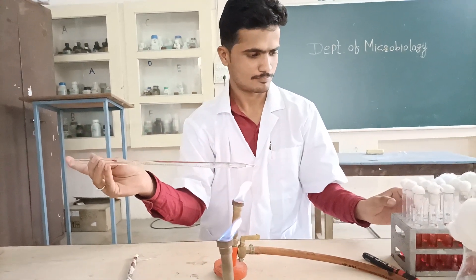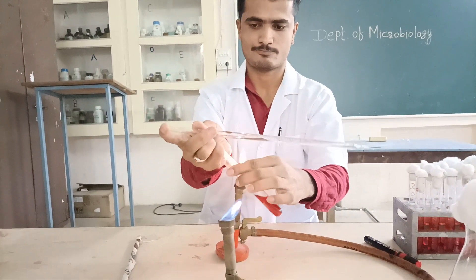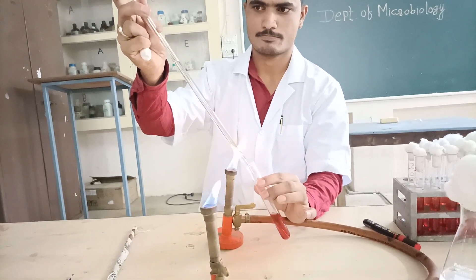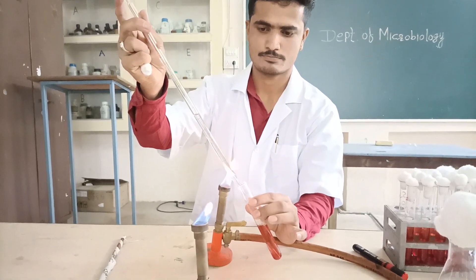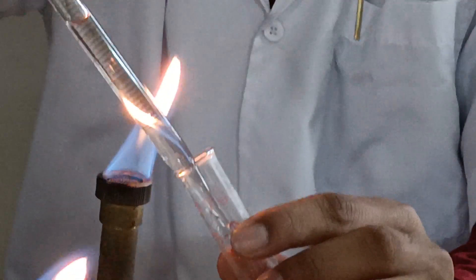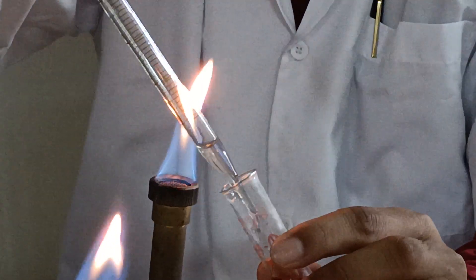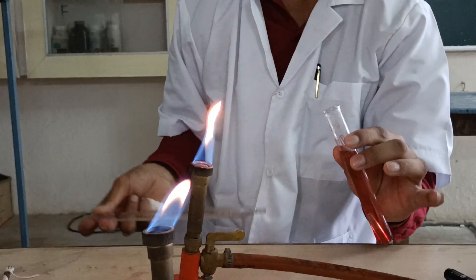10 ml of the water sample is used and inoculated into test tubes containing double strength McConkey's broth with Durham's tubes inserted. We have five tubes of double strength McConkey's broth, each inserted with a Durham's tube, and into each test tube we have to inoculate 10 ml of the given water sample.